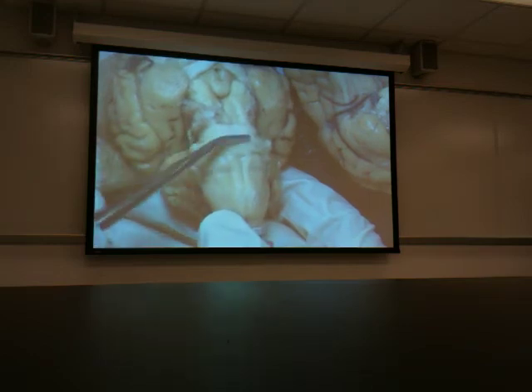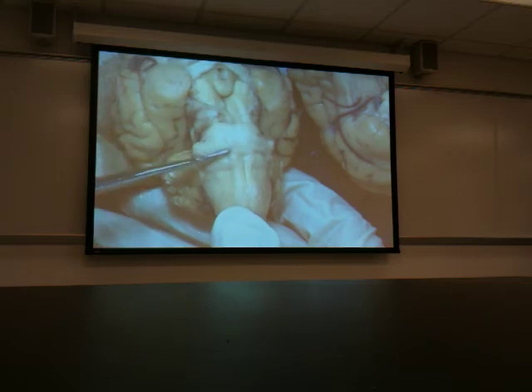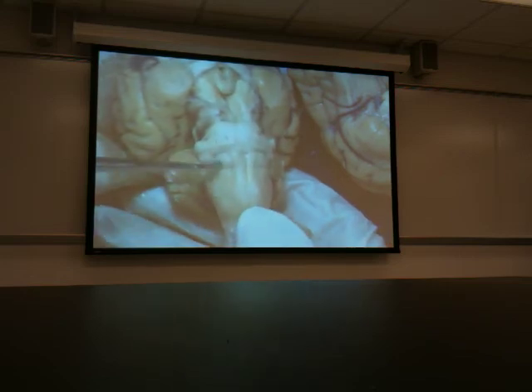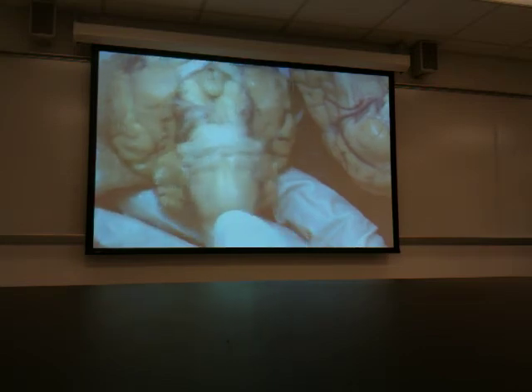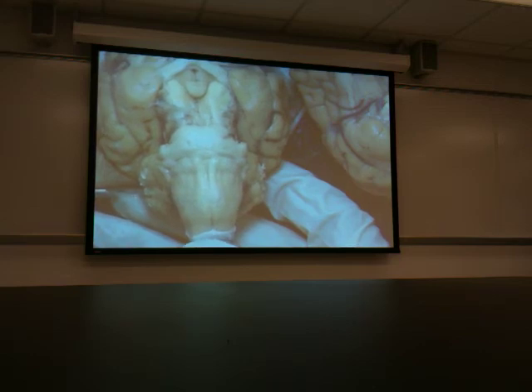What is this raised area here? Quickly. Pons. Of course. So that's the pons right there, but back behind that to here is the medulla oblongata, the whole thing. Look at that trapezoid body. Look at these medullary pyramids. They're much more apparent because the arachnoid has been removed.